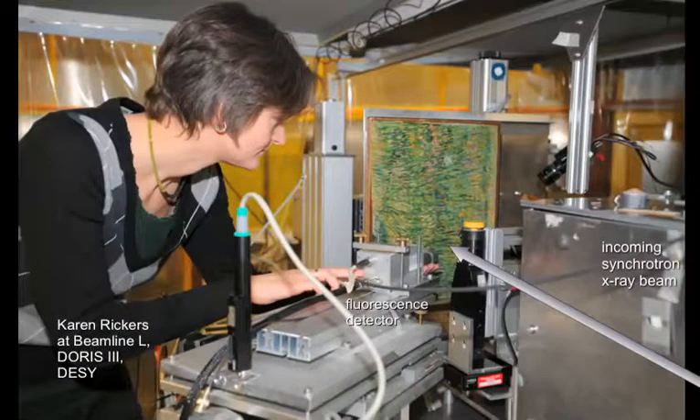During analysis, we used a thin pencil beam of x-rays to illuminate the painting, and then detected the fluorescence of that spot with a fluorescence detector. In that manner, we scanned the relevant area of this painting.